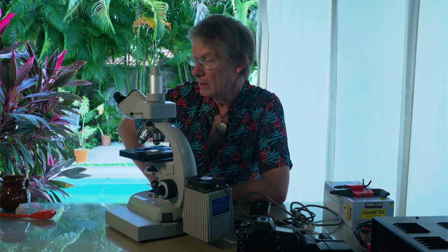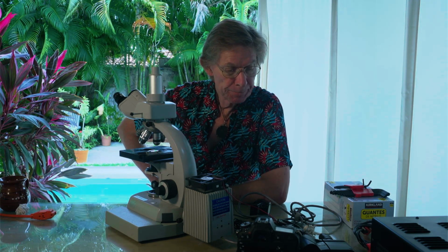I want to talk now about affordability issues, because people look at a microscope like this and they think it costs an arm, a leg, and a tooth and more than a car, which actually can be true if you're buying a new one. This is an older microscope from the early 1980s, and these are the microscopes that I've used over the years and that I supply to students when I teach.